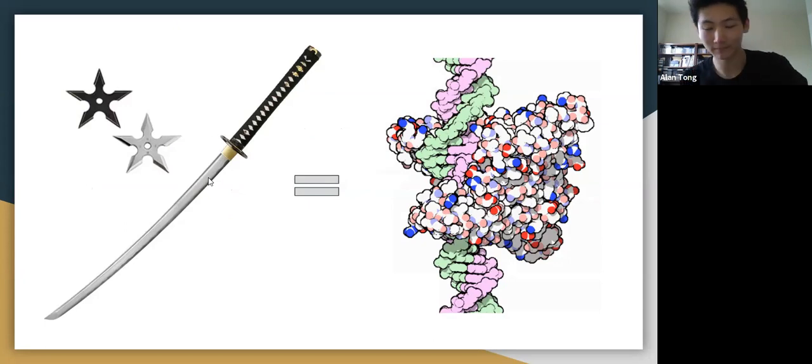This is how they do it. They express this protein that can bind to DNA, and then they can use their ninja skills, and that's their immune system. Let me show you what I mean. So this is their weapon, this protein here. Is it about CRISPR? Yeah, you're reading my mind. That will be later in the talk. We'll first talk about restriction enzymes, then we'll talk about CRISPR, which is almost like a subtype of restriction enzymes. So, good point.